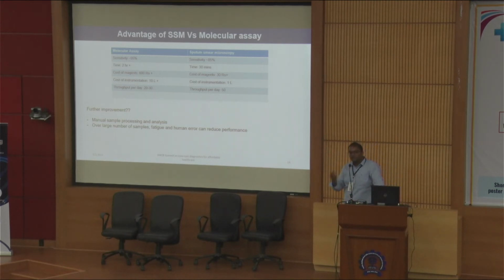And so we further wanted to improve how we can actually change this TB system a little bit better. Microscopy is still being used by a manual operator, and if you have to do 50 samples, you get fatigued. Manual errors are all feasible. So the question we wanted to ask is, can we digitize it? Can we automate it? And this was basically our next journey.